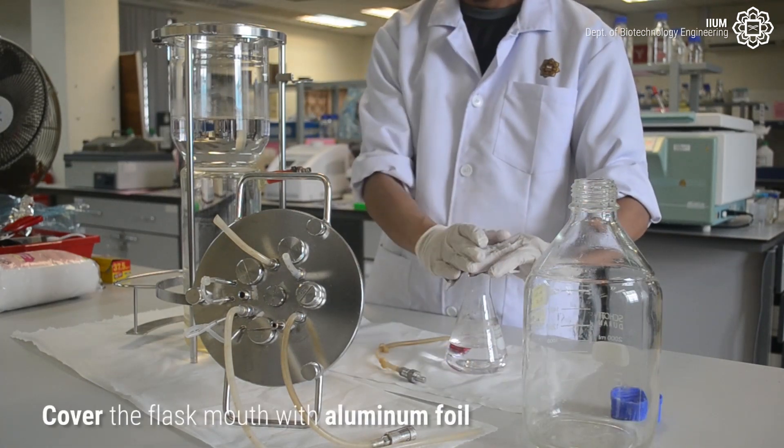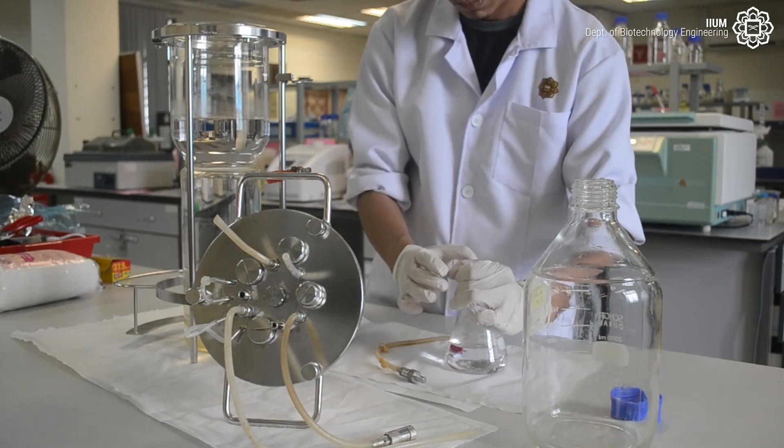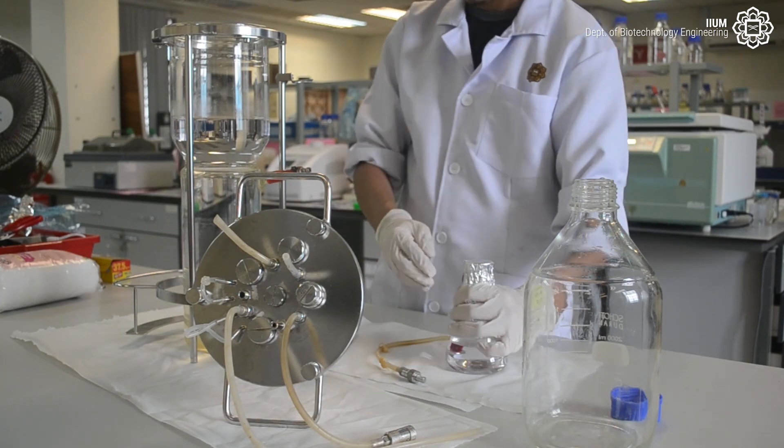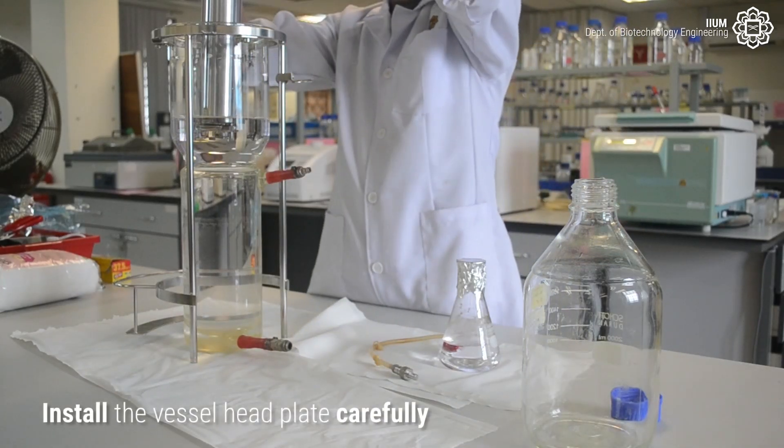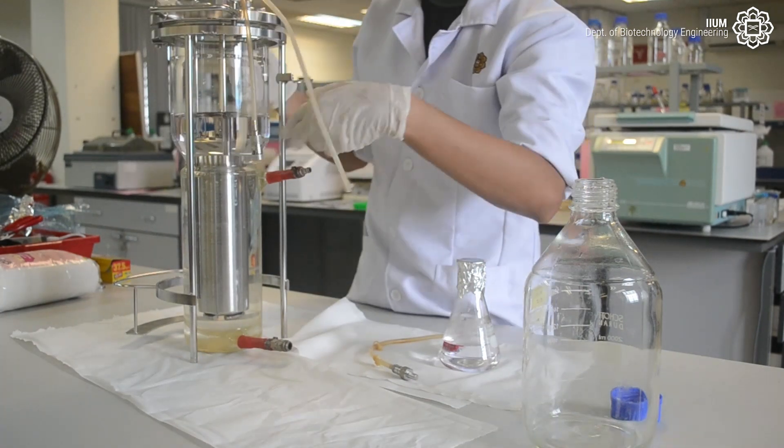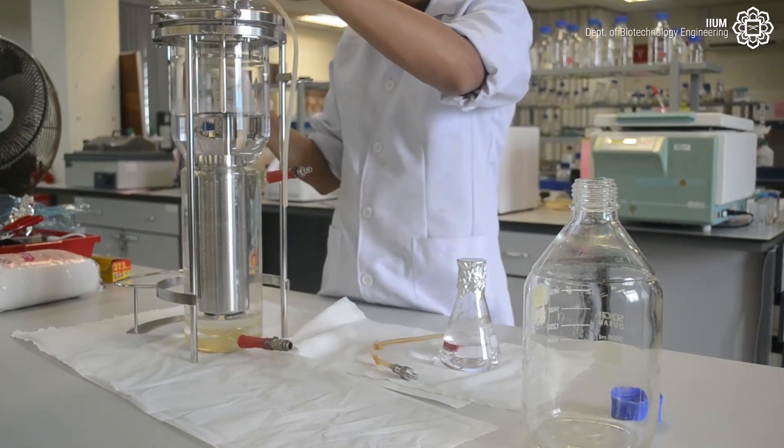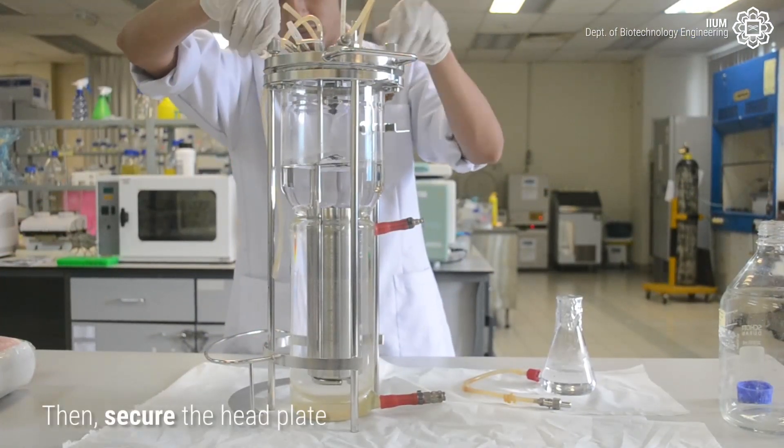Cover the flask mouth with aluminum foil. Install the vessel head plate carefully. Then secure the head plate.